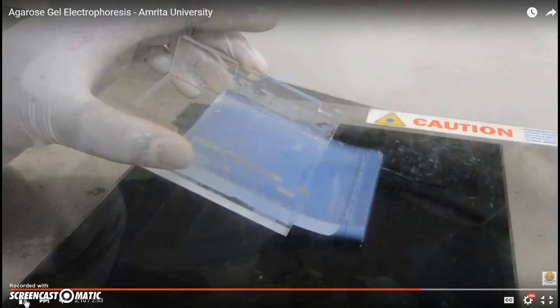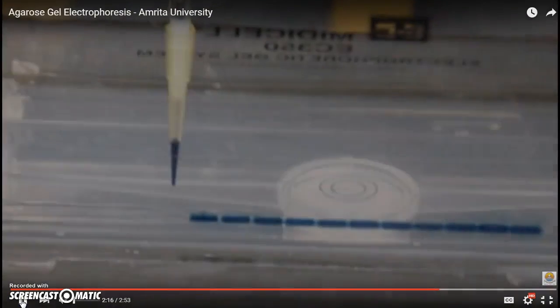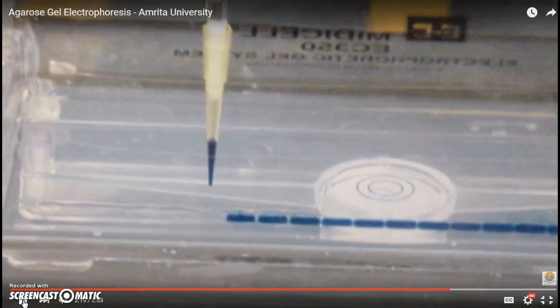This is one version. That is what the gel actually looks like. So it's sort of this clear piece, and it's tiny little holes here. Just play you a little bit more so you can see. Okay, so when we put the DNA in, the DNA is suspended in liquid, and there's a dye added to it just so we can see what we're doing here. But once it goes through and we turn it on, we'll have to add another dye because it kind of fades.